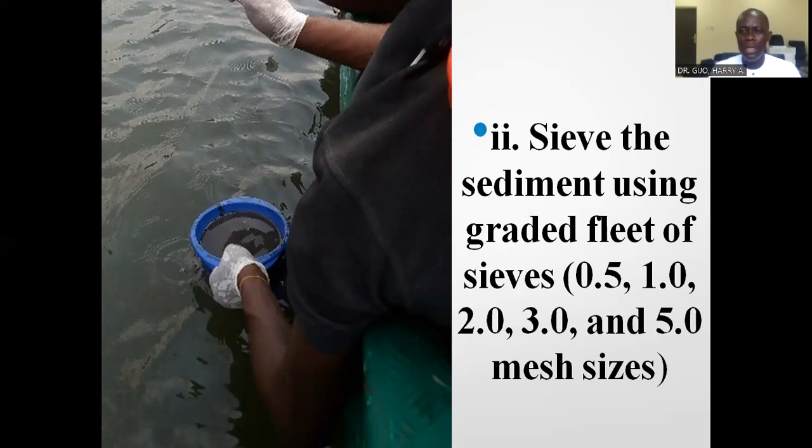But for subtidal sampling, right there in the middle of the river, you can turn them into a sieve and sieve. So you sieve the sediment using a graded set of sieves, usually sieves of 0.5, 1.0, 2.0, 3.0, and 5.0 millimeter mesh sizes, just as it is shown here. This sieve is being used to sieve the samples by moving it to and fro. You move the sieve while it's touching the water so that the sediments will go off while the benthic organisms are retained.